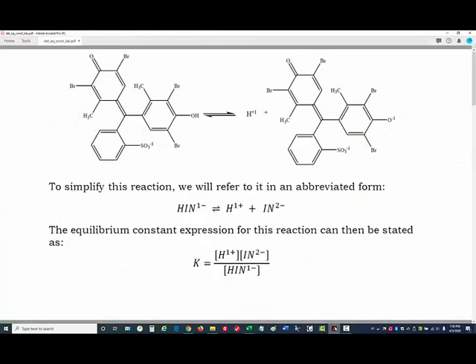I'd like to give my own overview of what this lab is meant to achieve. First off, we're studying a reaction involving an indicator. This is an acid-base indicator. This substance has a color associated with it and a color change upon losing its hydrogen.